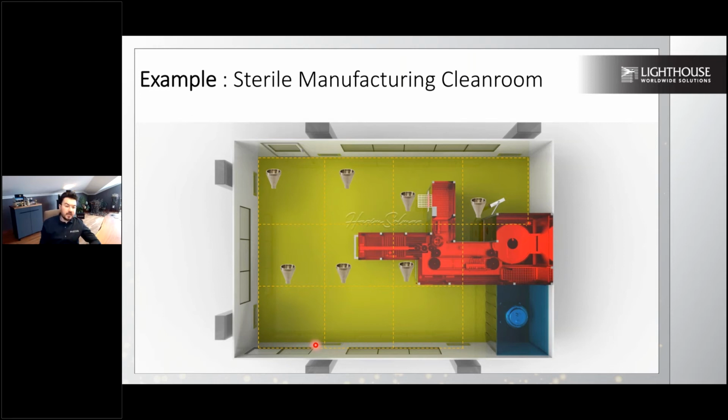That's why, if I divide the size of a clean room into 10 sample locations and I remove critical points like this while I'm overthinking about making exactly the same size locations, I don't prefer it. I just want to make my point. I said that's my critical point. I know the size is not equal to the rest, but it is still very important. That's why I'm going to sample it.